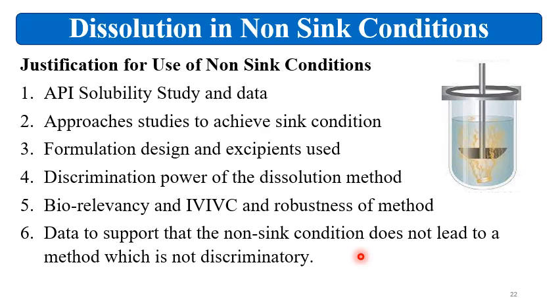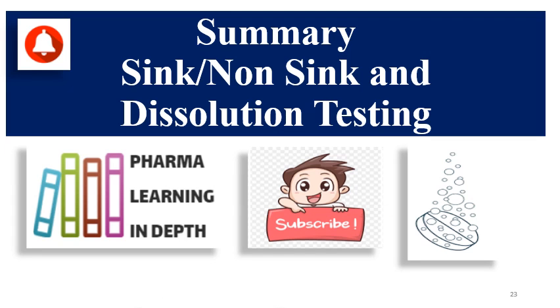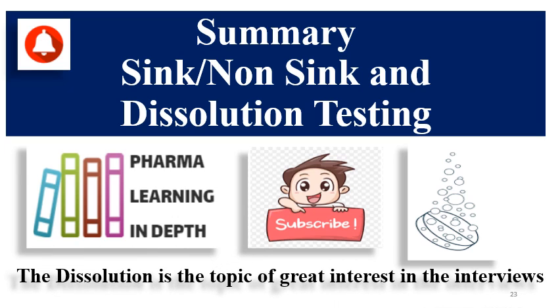That means in other words, the non-sink conditions are there, but still the dissolution method selected for routine testing of the formulation is a discriminatory method, and it can detect the good and bad batches. So this is how the sink conditions are required, then how these are determined, and when there is a problem of getting the sink conditions, then how non-sink conditions can be used and what the justifications required are.